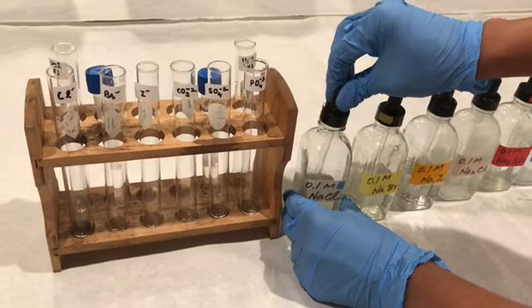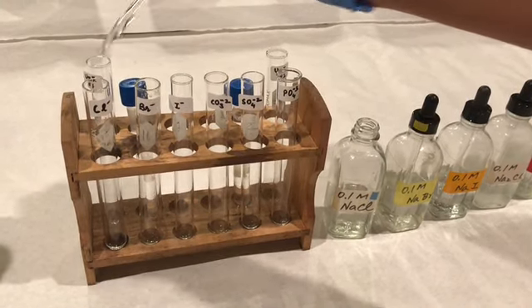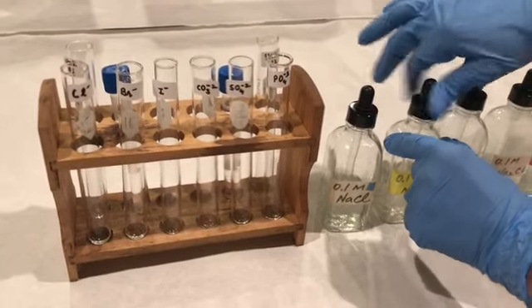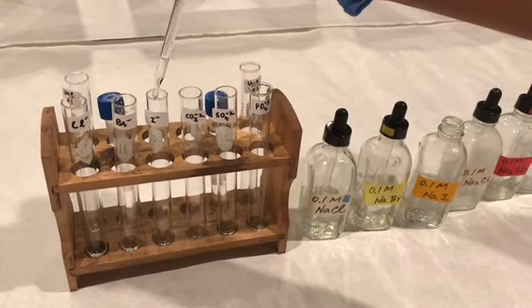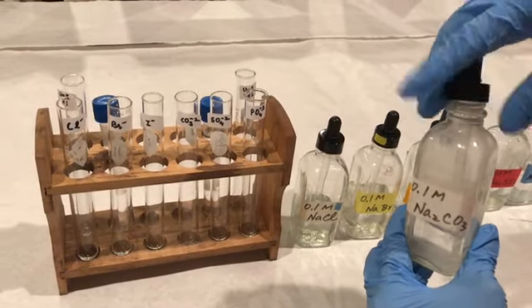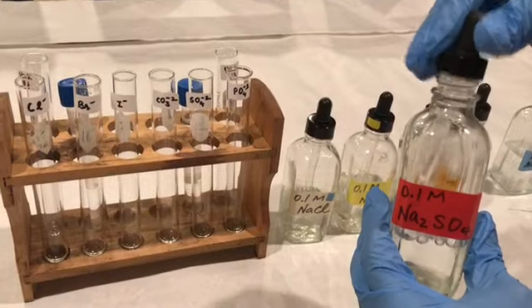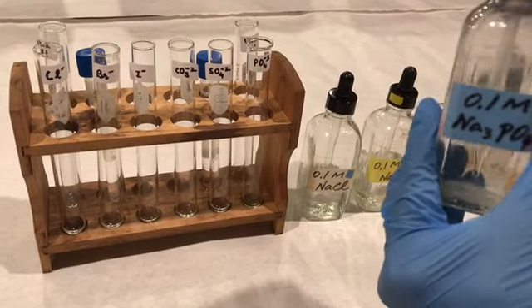Okay, so now I'm going to add the different test solutions in the different anion test tubes: chloride, bromide, iodide, sodium carbonate for carbonate ion, sodium sulfate for sulfate, and the last one is sodium phosphate for phosphate ion.